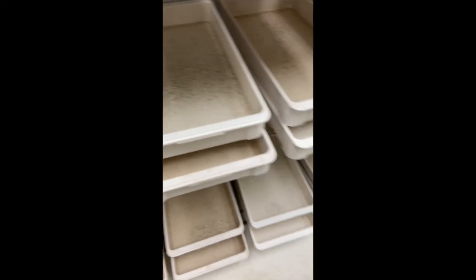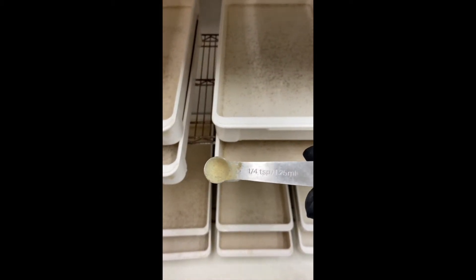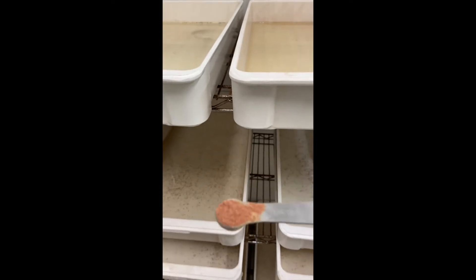On Monday through Thursday, to feed these trays of large larvae, you use the one-fourth teaspoon scoop and get about an even scoop of fish food — a level scoop.